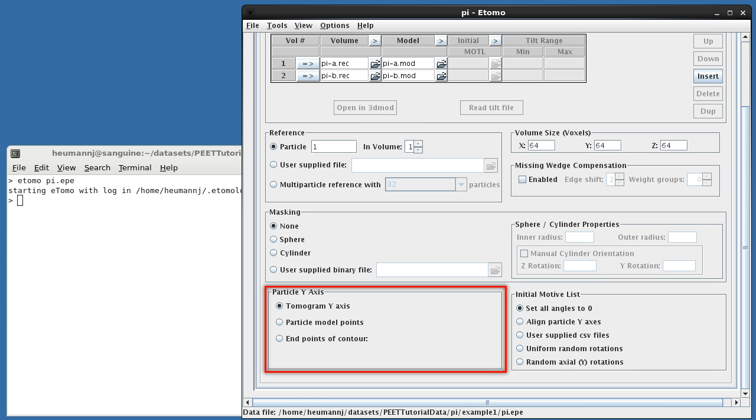For rotations, it's more appropriate to use a particle coordinate system, which you can picture as attached to and moving with each individual particle. We'll see examples where this is useful in later tutorials. In this case, the particles have no preferred axis, so we've set each particle's initial y-axis to be identical to the tomogram y-axis.